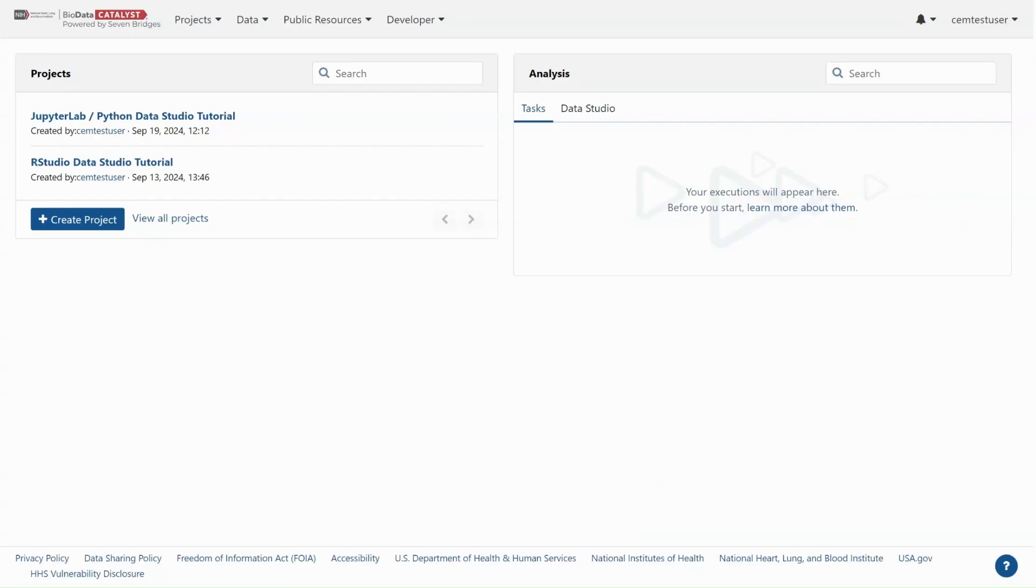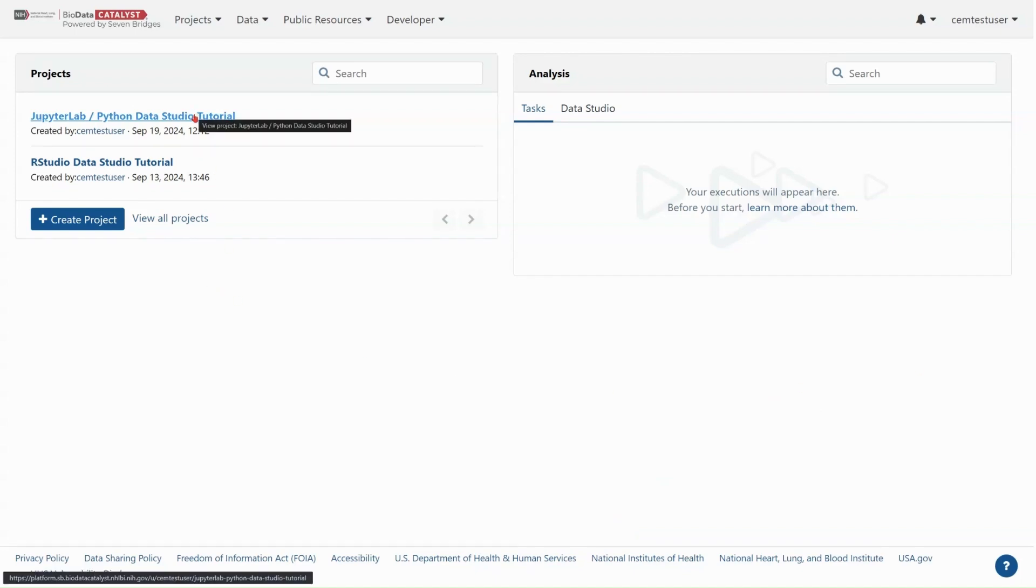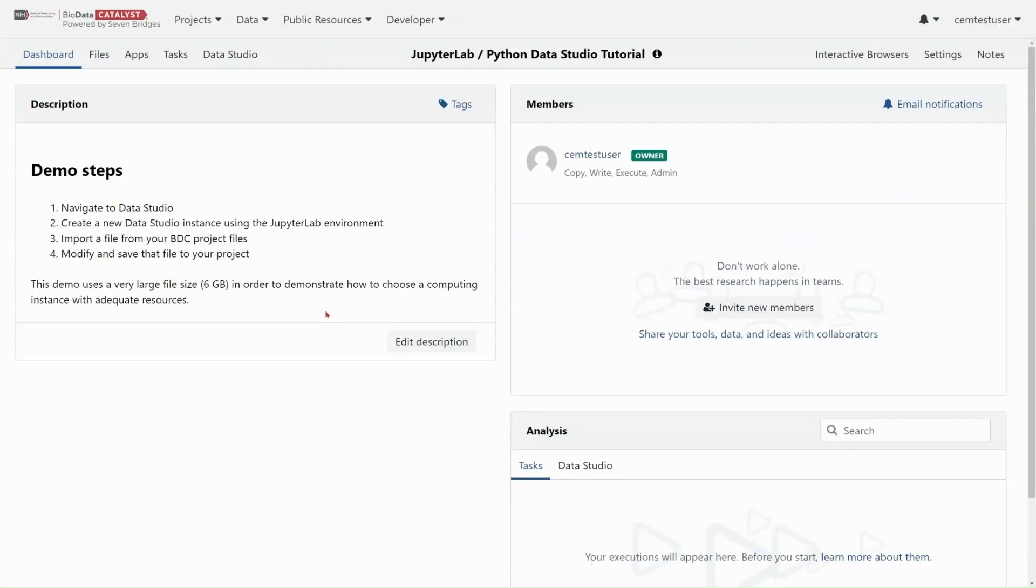As you can see, I'm already logged into Biodata Catalyst powered by Seven Bridges, and I will open the project that I've created for this tutorial called JupyterLab Python Data Studio Tutorial. Here on this project dashboard are the steps I will be taking in my demo. We will navigate to Data Studio, create a new Data Studio instance using the JupyterLab environment, import a file from our BDC project files, modify and save that file back to this project.